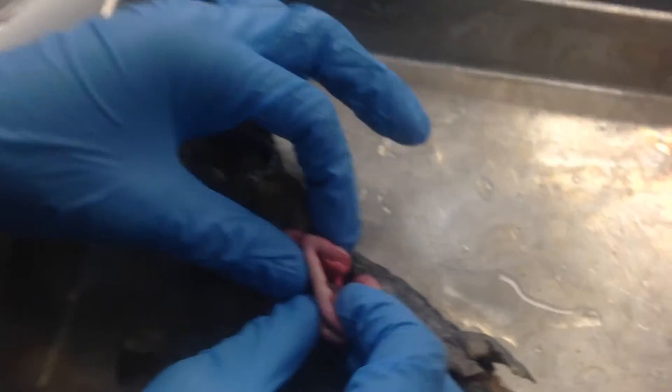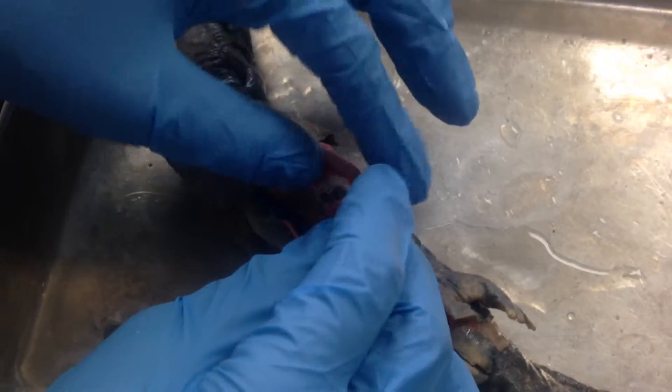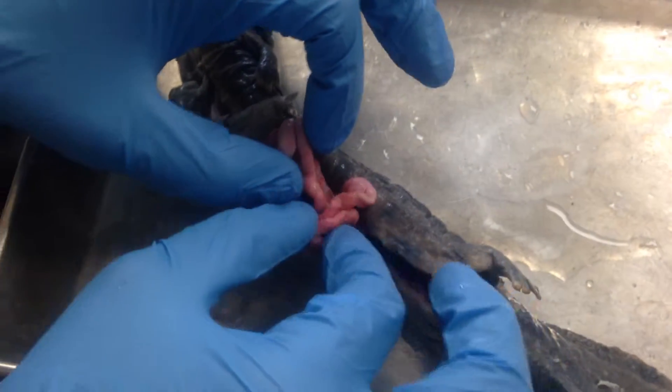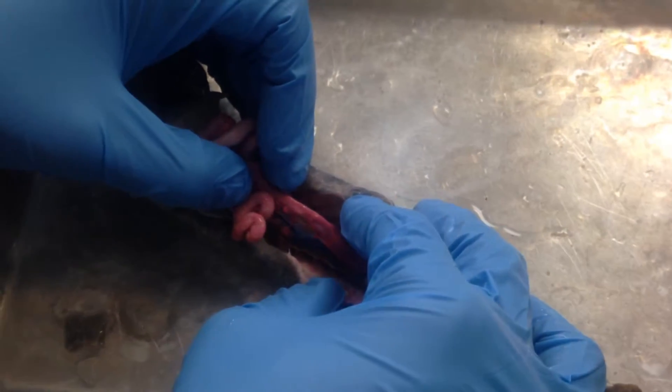This is the small intestine. The pylorus is in here, going into the duodenum, then the ileum, and that leads to the rectum.